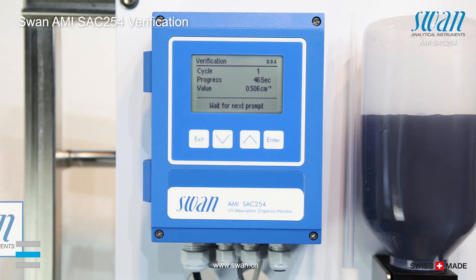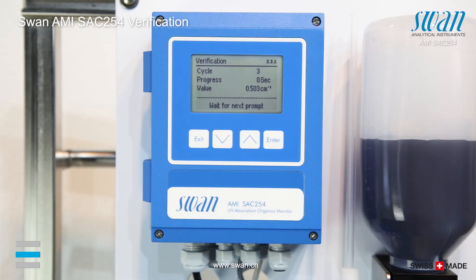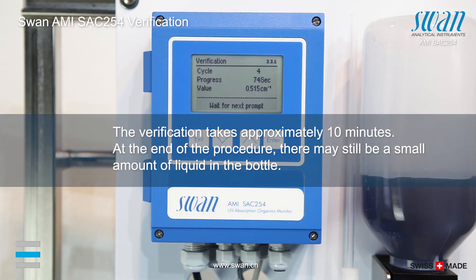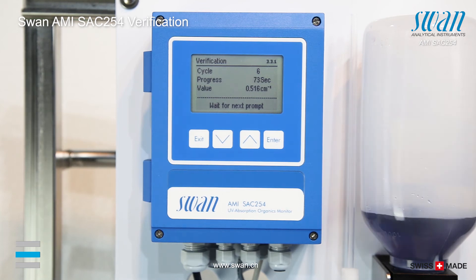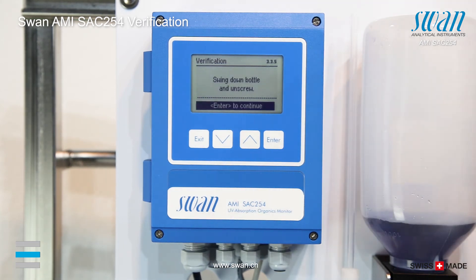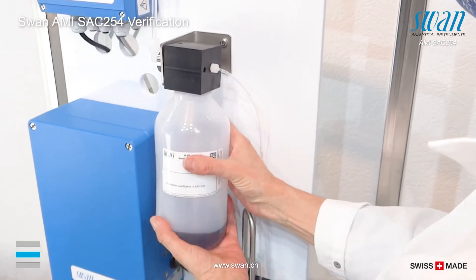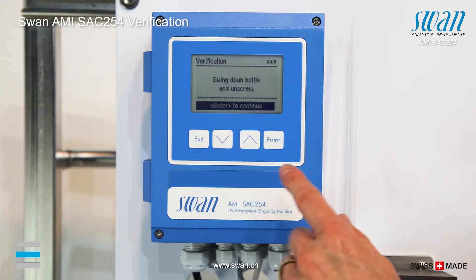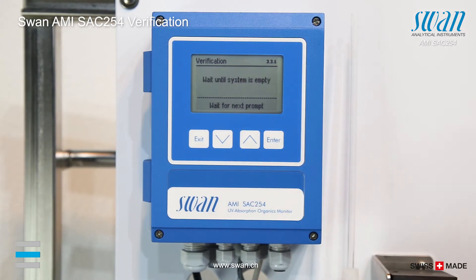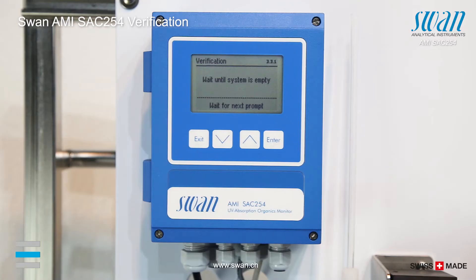Put down the standard bottle and take it off from the holder. Continue with ENTER. The instrument is automatically drained.